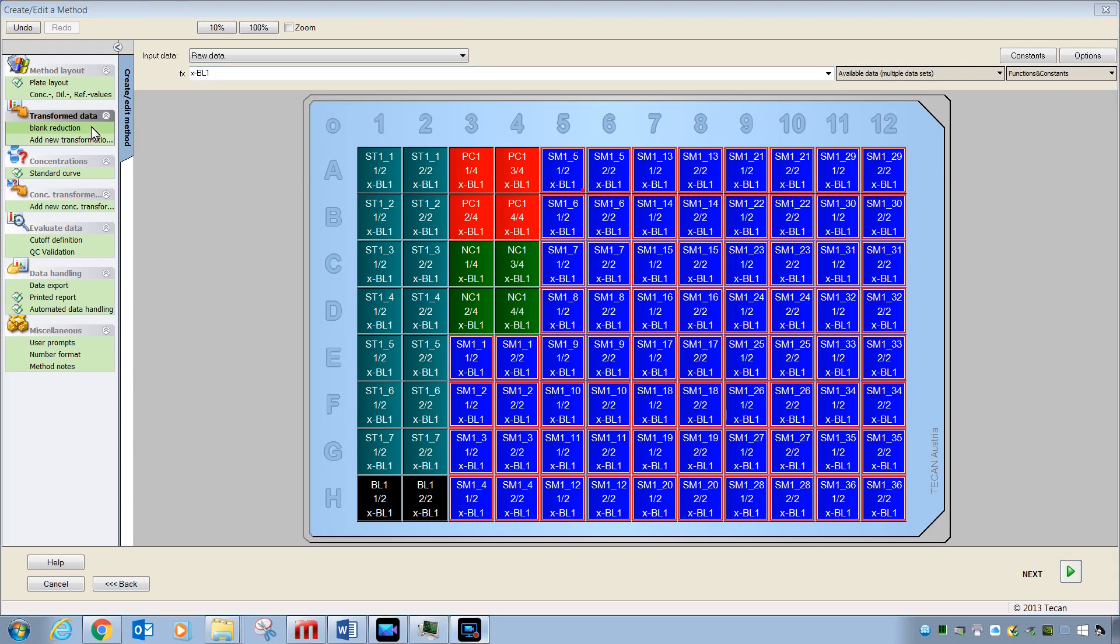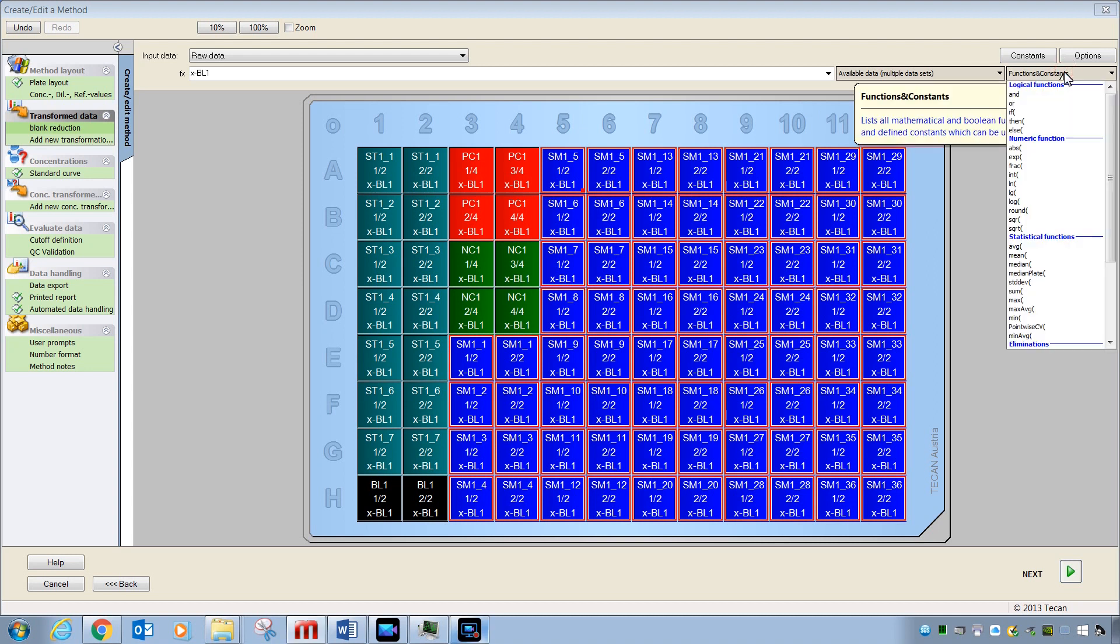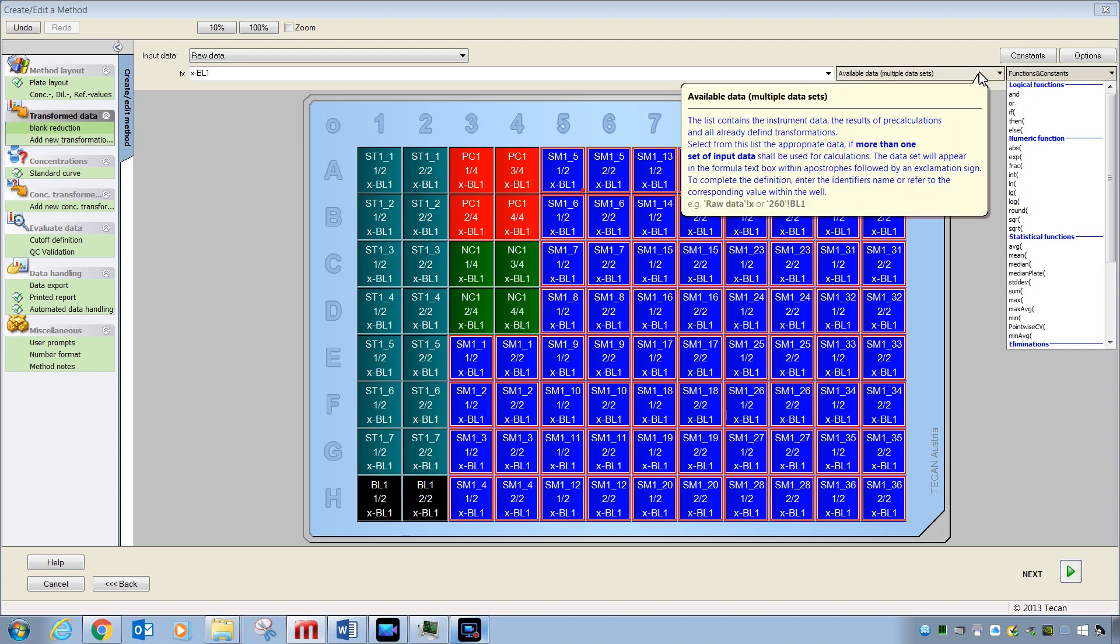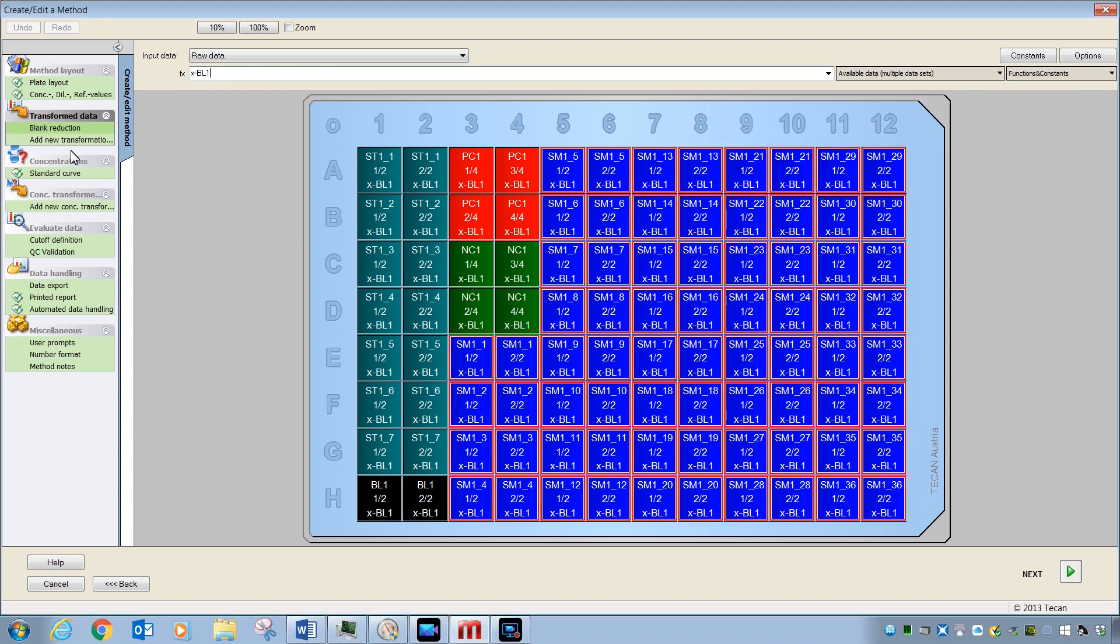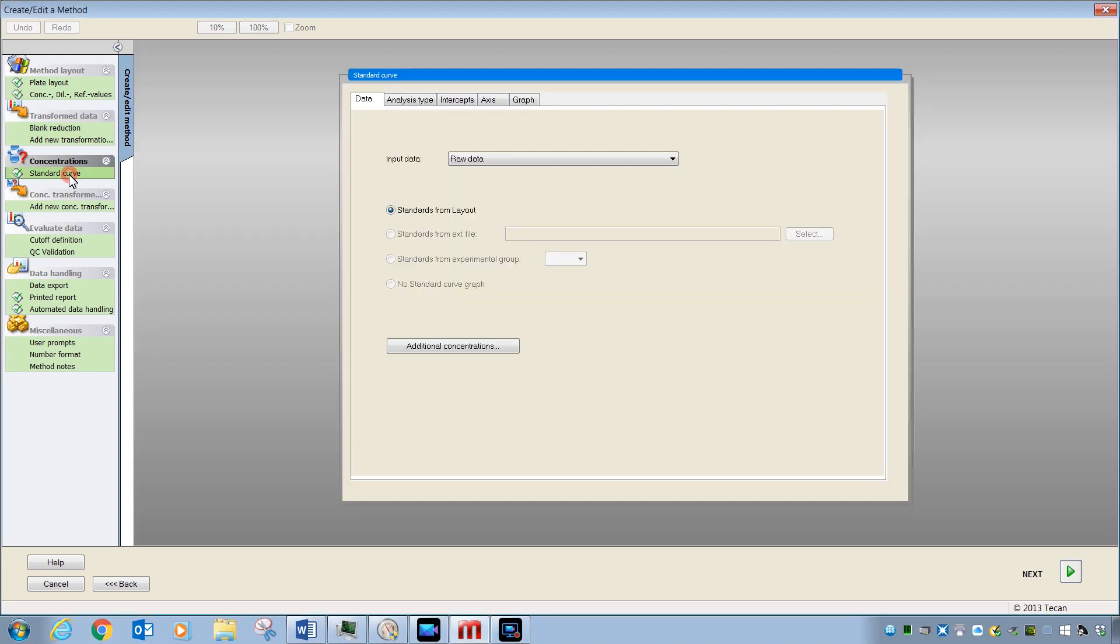If you would like to do some additional data analysis and create your own calculations, Magellan has an extensive selection of different functions and ways for you to create your own custom transformations. To learn more about how to use these abilities, look for other videos on this channel or contact TCAN. We will now move along to the standard curve setup.